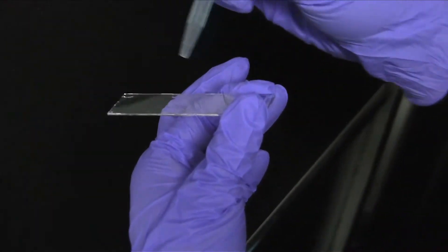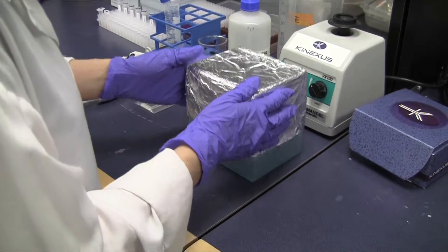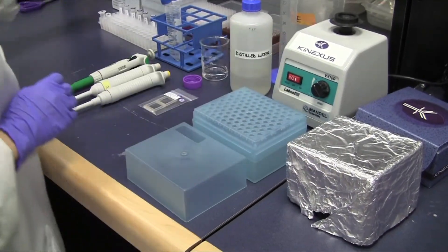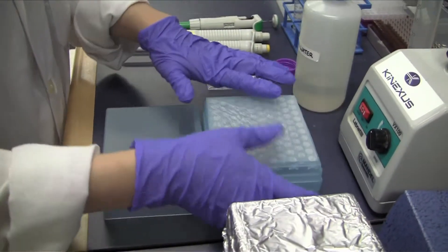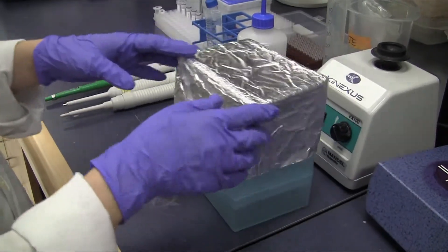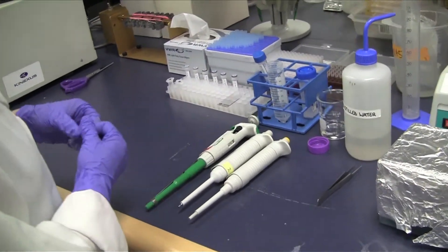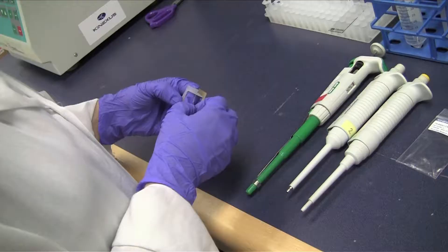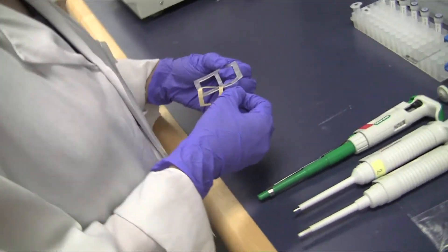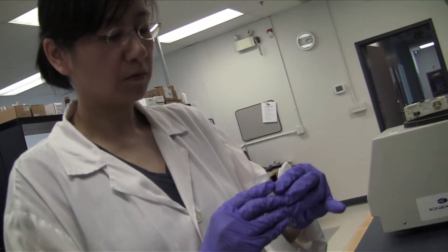Dry the microarray with nitrogen flow and place the dried microarray on the bench facing up. Peel off the paper backing from the adhesive side of the CAM 2-well incubation chamber, part CAM-C, and lower it carefully onto the surface of the microarray with the adhesive side facing the array.